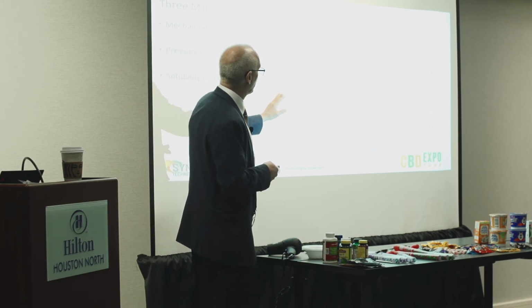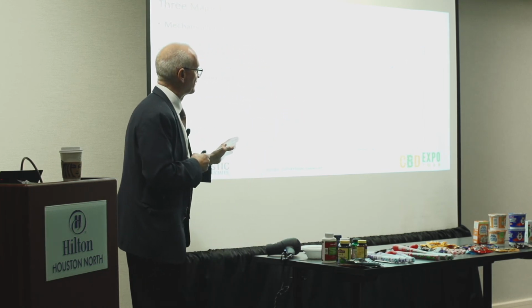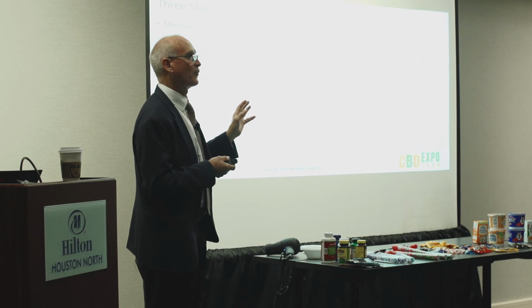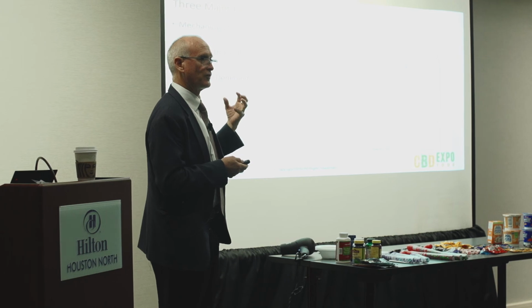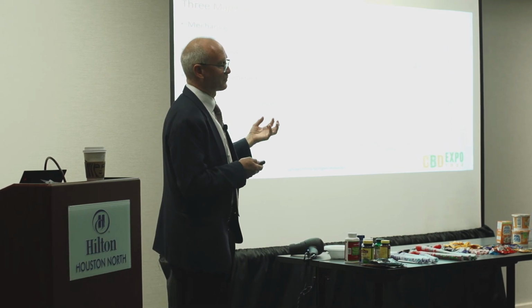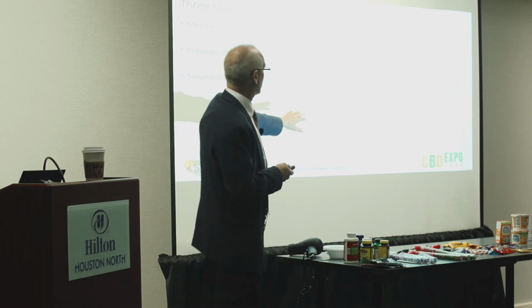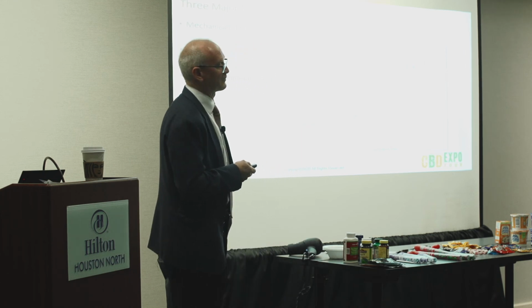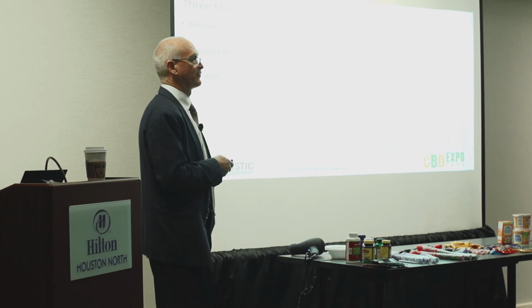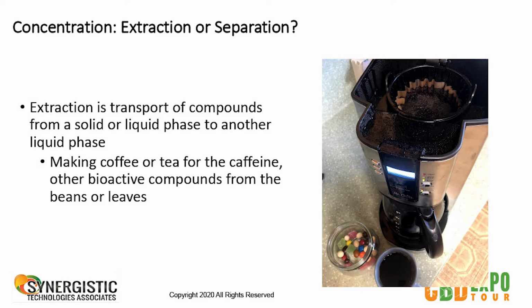But that's why when you're looking at that first part and you only shake it up for a little bit, you're not going to get the full sample out of that. Sometimes people put in an hour to get all the material out, because it looks like it's fast, but that isn't the case. On the side of the chemistry, it takes longer during that last part if you really want to get a true answer. If you have coffee and you're extracting coffee, that's exactly what you're doing.